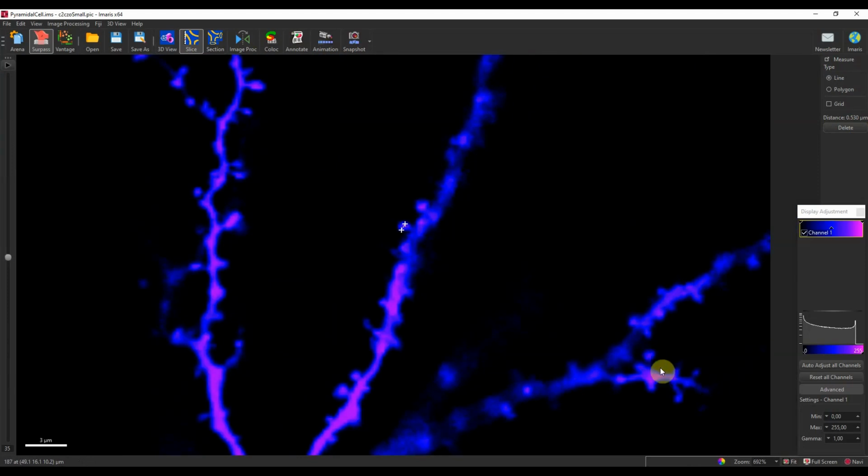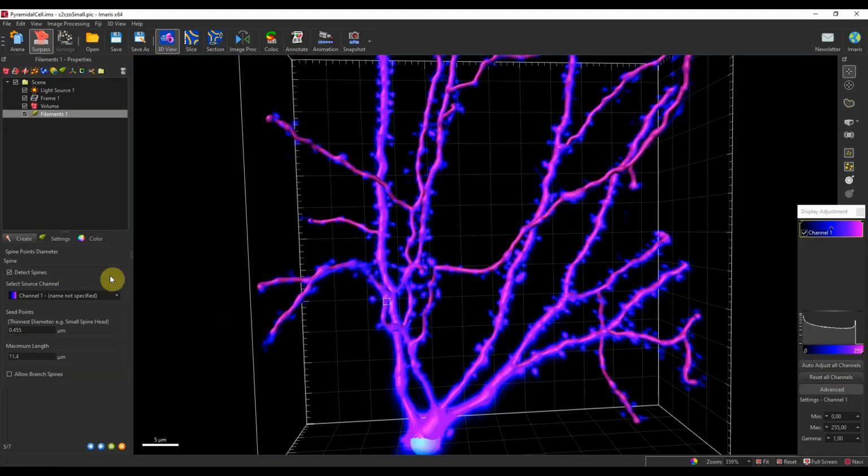I would of course do this on a larger sample than just 1 or 2, but let's say I would estimate something about, so this number would be about correct. So 0.45, I measured around 0.5, so I will keep this value here.